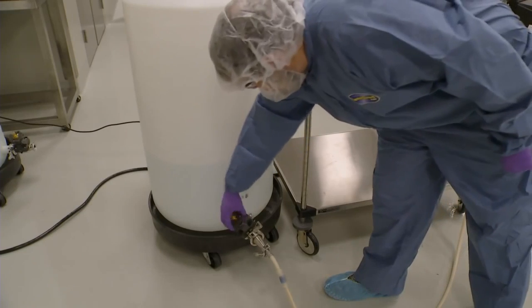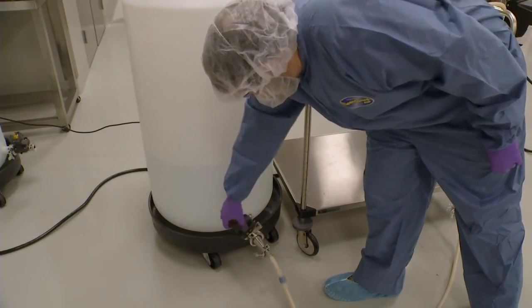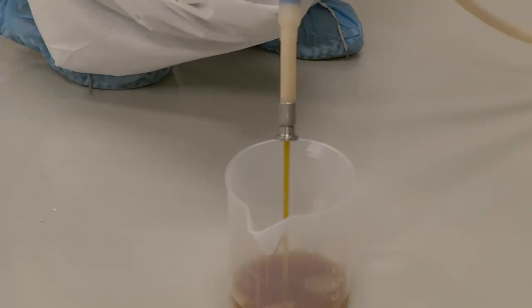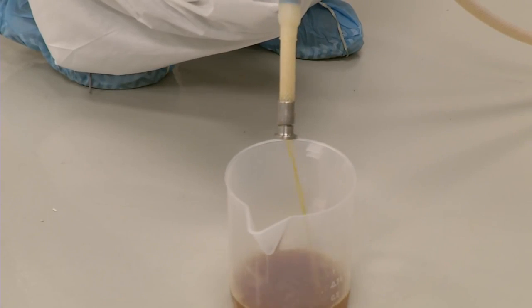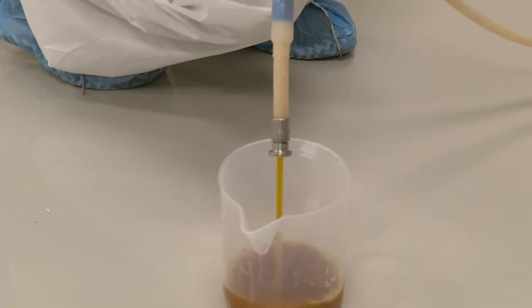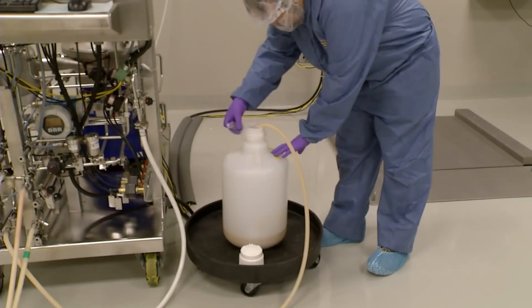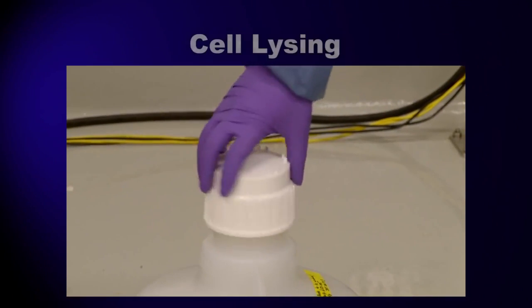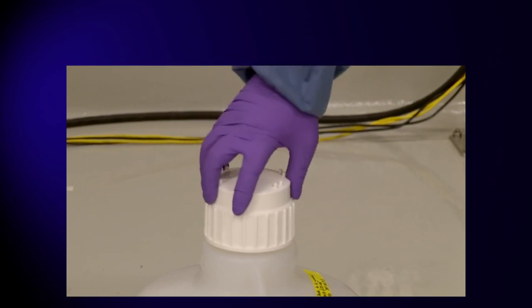The cell paste is suspended in a buffered solution, and then run through the centrifuge again. As the clarified liquid leaves the centrifuge this time, it carries many of the contaminants from the fermentation step with it. The cells, once again in paste form, are ready for the next step, cell disruption, also called lysing.